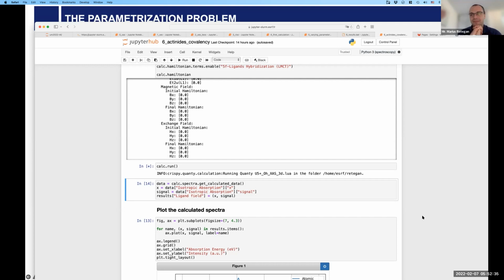If you then have this Jupyter notebook and you say, well, we measured file number 712, and this is how it looks like, I think that's a nice feature. They can look through afterwards while you do the experiment. For instance, the night shift goes home, and the guys on the day don't know how the sample was looking in the night, and they can easily look at the sample and say, okay, now we have a problem, or it looks better or worse, or we have to change sample.